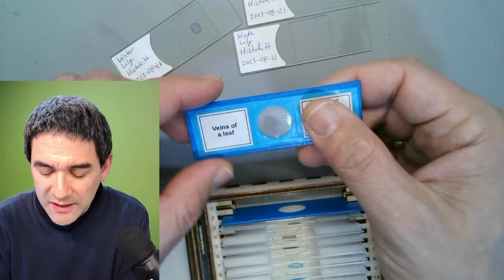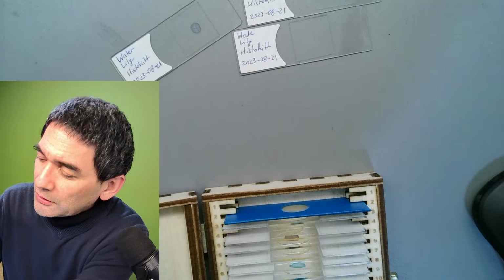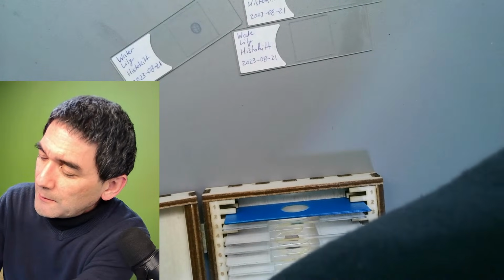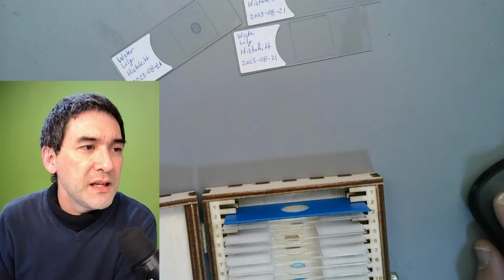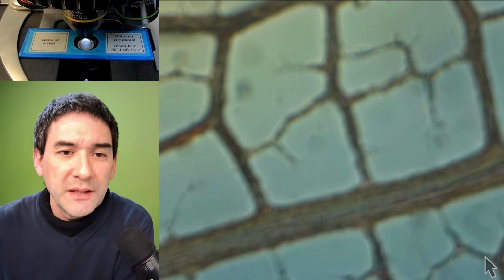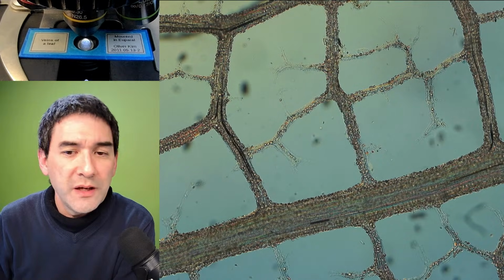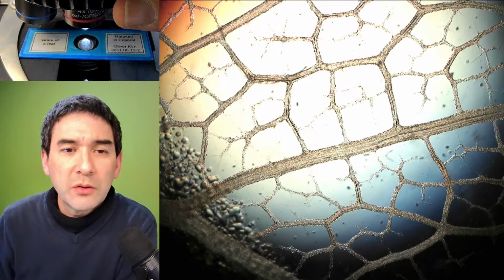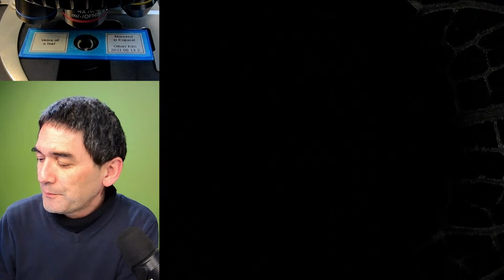This one is also a nice one. Many of you already know that. That's the veins of a leaf. Every fall, I like to prepare some leaf veins, and they look quite nice. I made a permanently mounted slide of that, and I'm going to, of course, also turn off the arrow. Usually they look quite nice under low magnification.